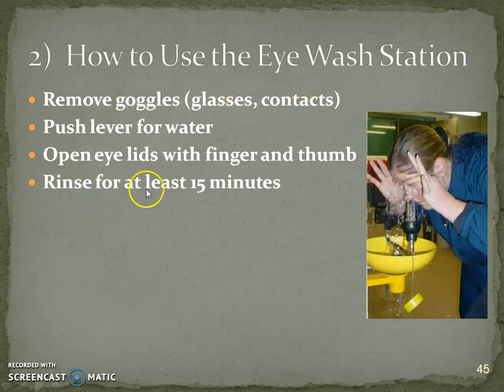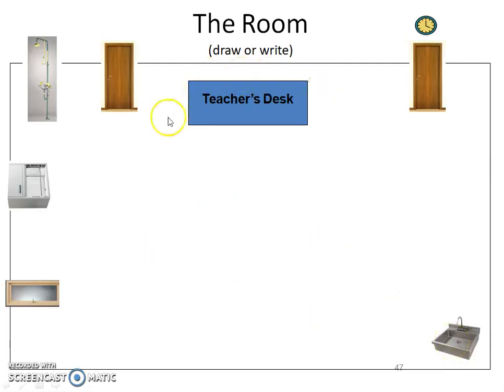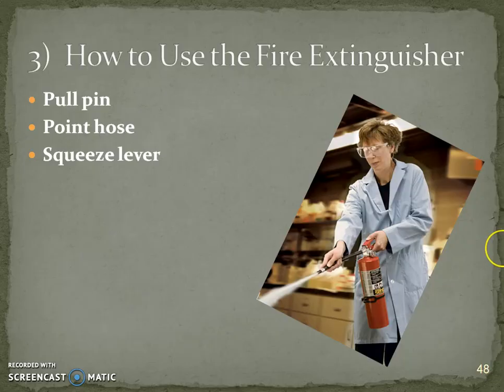To use the eyewash station you'll need to remove your goggles since they should be on your eyes at that moment. For the fire extinguisher, it is attached to the teacher's desk — either write it or draw it in. If asked how to use the fire extinguisher, you must say pull the pin first or it won't work.